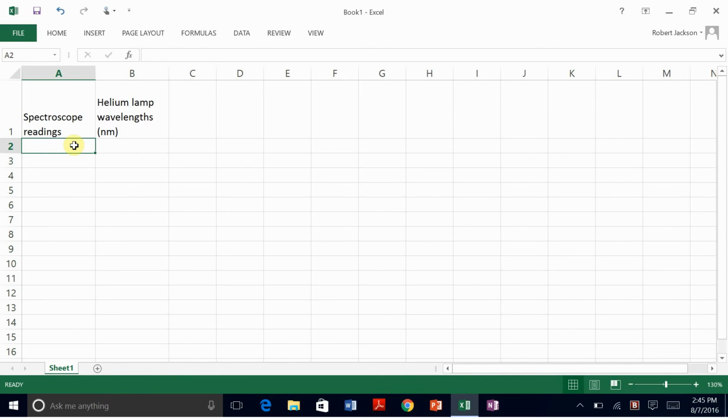Okay, so now I'm going to enter my first few values. I just enter the first couple. So 1.20, 1.72. And again, these are arbitrary numbers, so there's no units involved. These will be the wavelengths. These will actually be in your lab book, so you won't have to find these. You'll just look them up in your lab book. So again, I'll just type in the first couple.